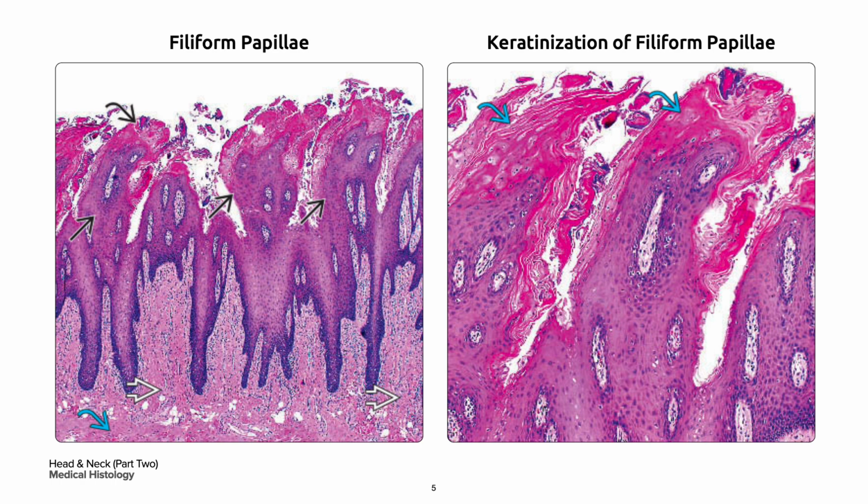Throughout the tongue, only a small amount of loose connective tissue in white bold arrow separates the mucosa from the underlying striated tongue muscle, that is in curved blue arrow. Looking on your right are the tips of the filiform papilla, which are heavily keratinized in curved blue arrow. Again, the filiform papilla generally lack taste buds.